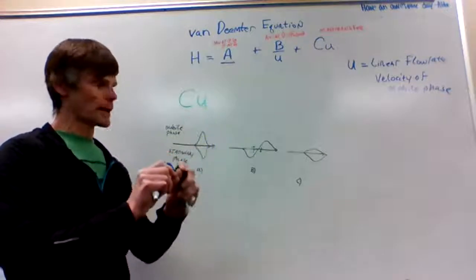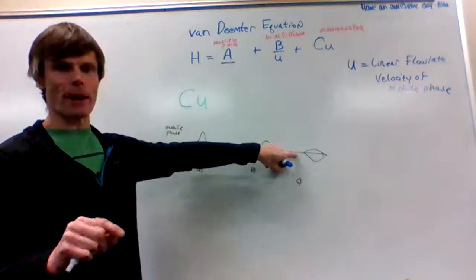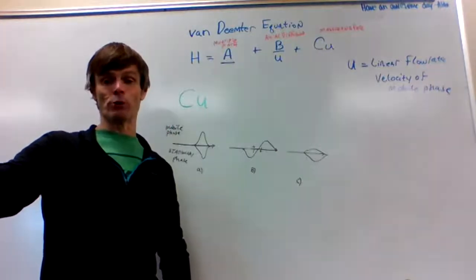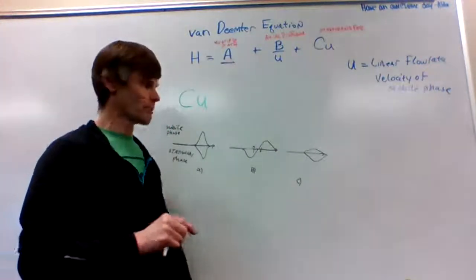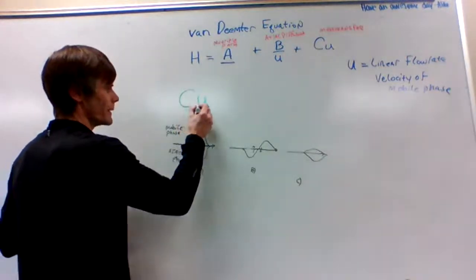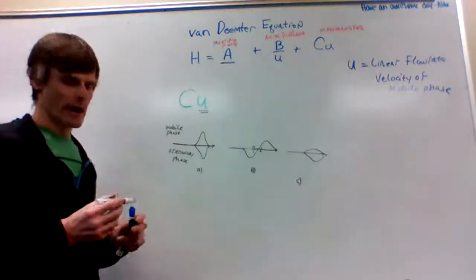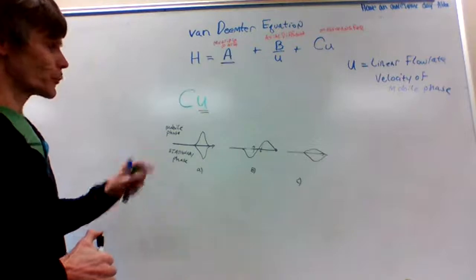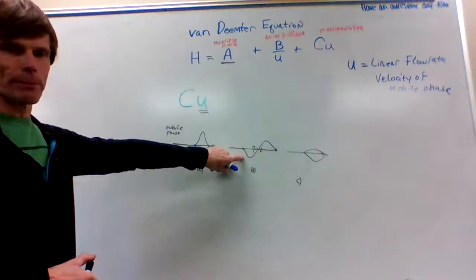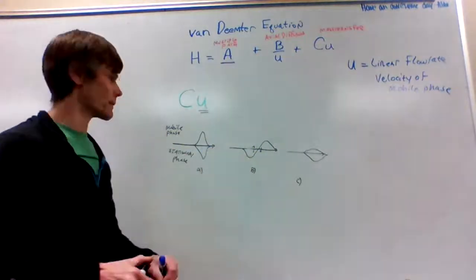They have to re-equilibrate, and eventually we get a band that's broadened due to this transfer of mass, where some of it is staying in the stationary phase a little longer than some of the guys moving in the mobile phase, which are further downstream. And we get a broader band. Now, this is directly related to our flow velocity, our linear flow rate. Let's think why. If we're moving this real fast, then we're moving the mobile phase much faster than the equilibration from our stationary phase can meet up with. And that's going to cause band broadening.